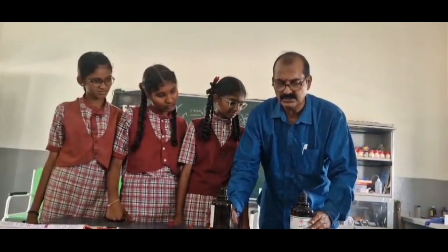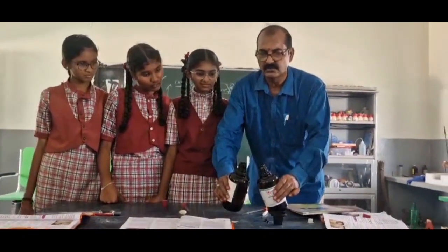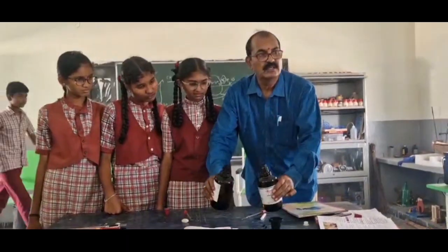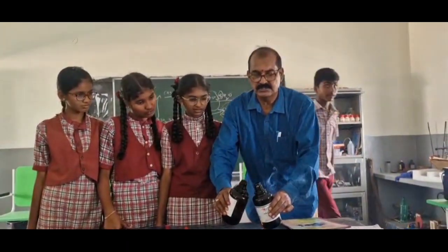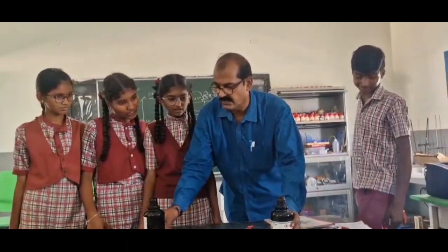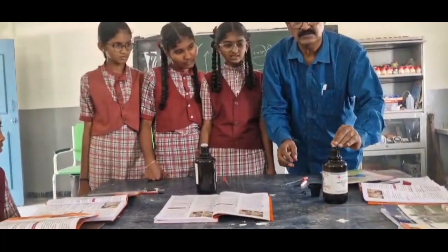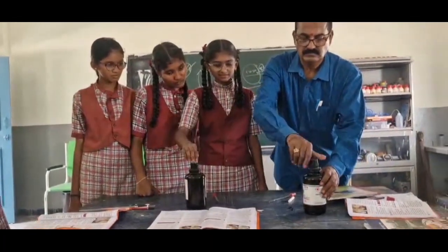See, you just, I am touching near to that one. So we are observing the fumes form. Are you understanding? Yes, sir. So this is the ring also. See, this is the HCl. This is the ammonia. Okay. That is the close of that one.